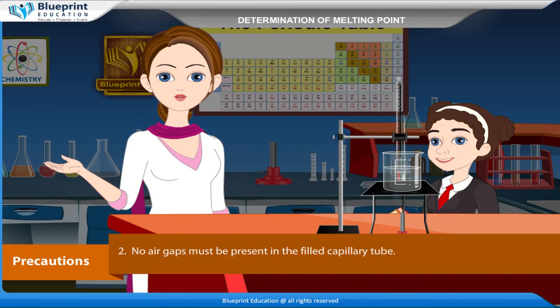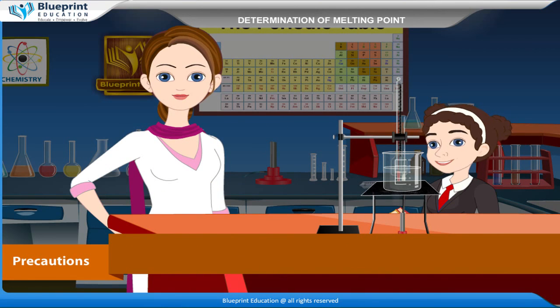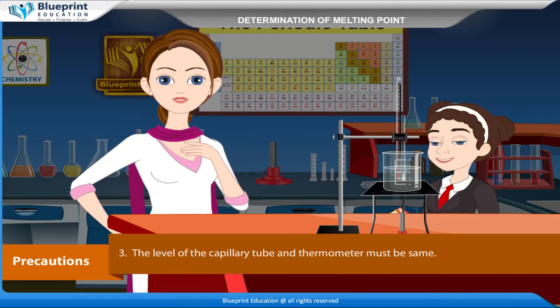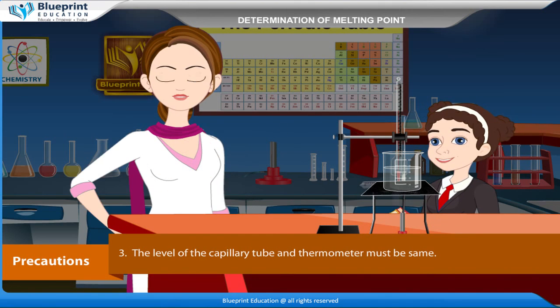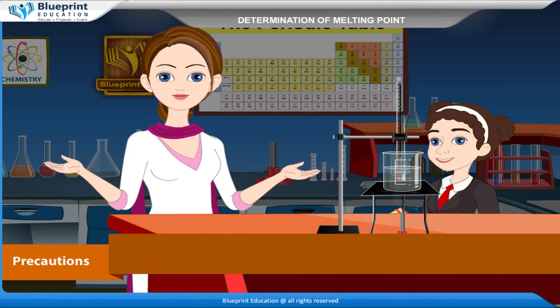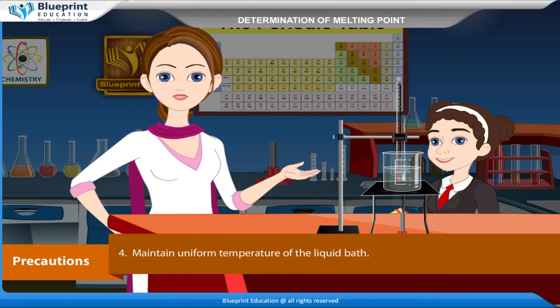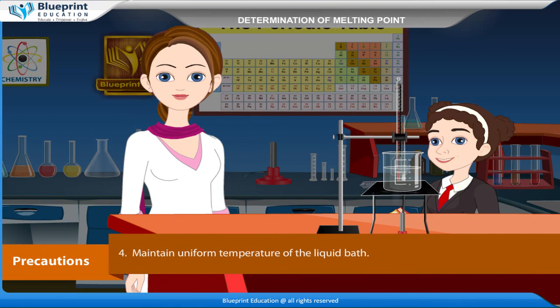Precautions: The sample solid must be dry. No air gaps must be present in the filled capillary tube. The level of the capillary tube and thermometer must be the same. Maintain uniform temperature of the liquid bath.